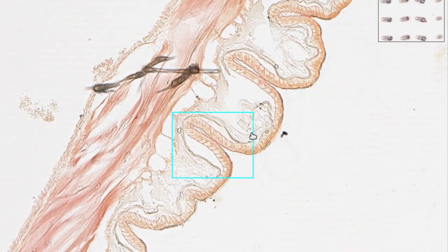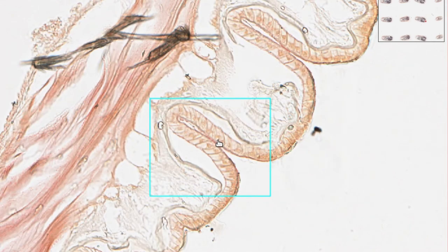So if we zoom in, as I mentioned, or I may not have mentioned, the staining in this slide is quite faint. It's faded over time, so this is quite an old slide. So if we dash back now to our guide on the anatomy of branchiostomes or lancelets, we can start to use it to identify some of the structures that we can see on the slide.